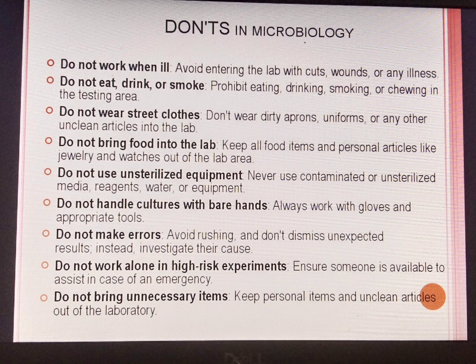Don'ts in the microbiology lab. Do not work when ill. Avoid entering the lab with cuts, wounds, or any illness. Do not eat, drink, or smoke. Prohibit eating, drinking, smoking, or chewing in the testing area.